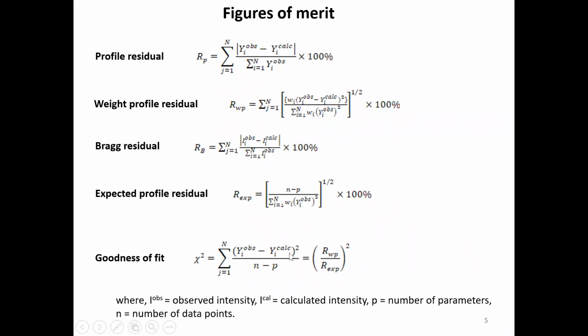Yes, the squares should become 0, but it can be given by this also, so these ratios need to be unity. No, that is all right, but how do you explain it from the first formula? When y i observed equals y i calculated, how should I ideally expect chi-square equal to 1 when it should go to 0, right? So what are we missing here?